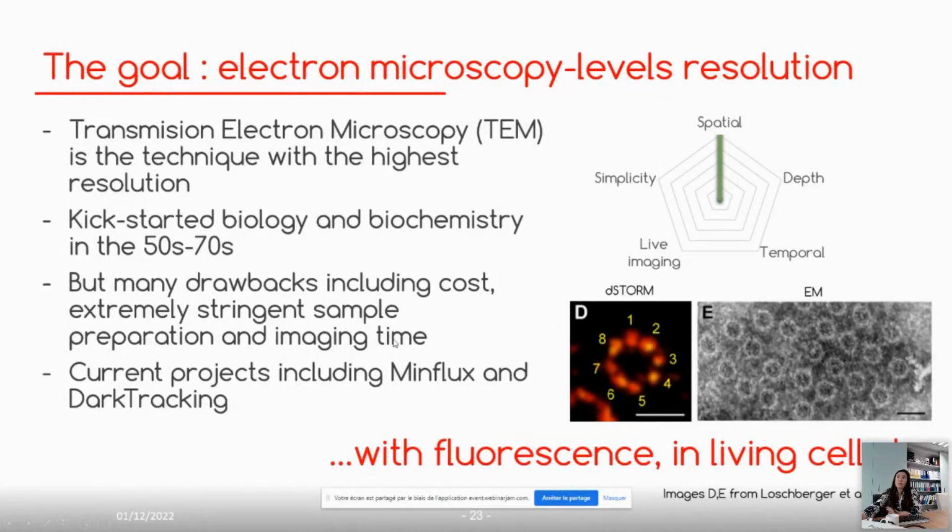So working towards this goal in mind, there are projects and products that are working towards getting to this standard. And by this, I mean single nanometer level, but using fluorescence and doing it in live cells. So some projects include the MinFlux technology, but also a product that we're working on called dark tracking. So these techniques are aiming for single nanometer level.